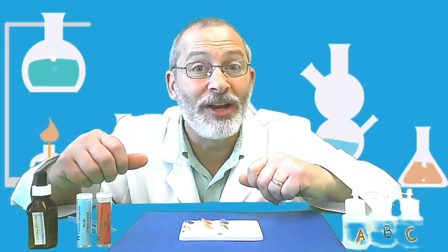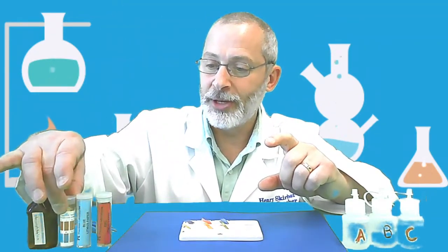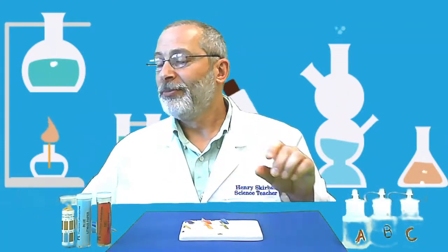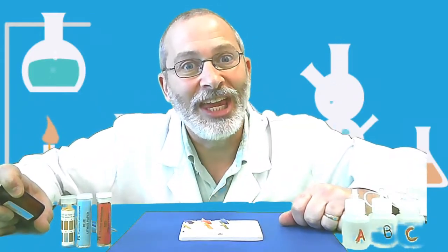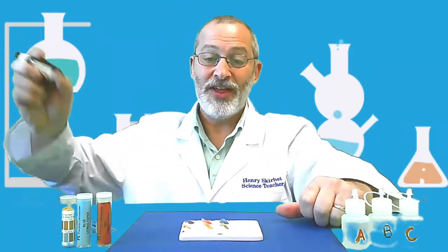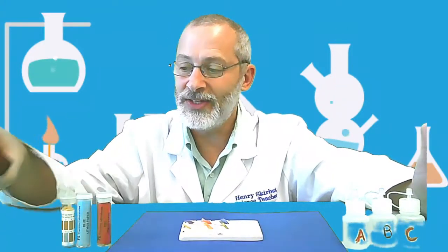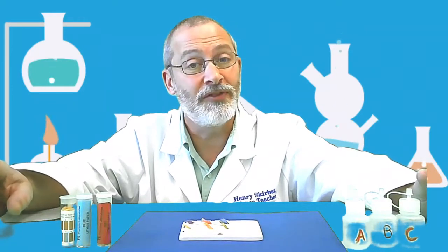Let's do one final test, shall we? So that's the pH paper test. The last test is my favorite, just because of the word, is phenolphthalein. So phenolphthalein. Remember what phenolphthalein does in the presence of either an acid or a base. Refer to your notes if need be.